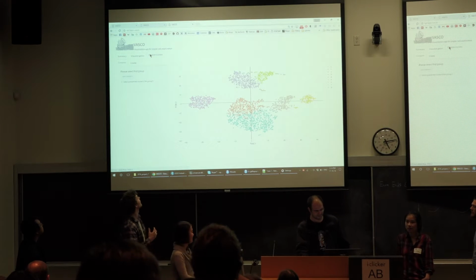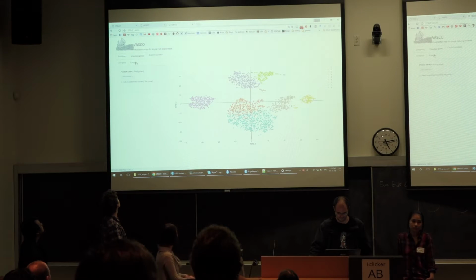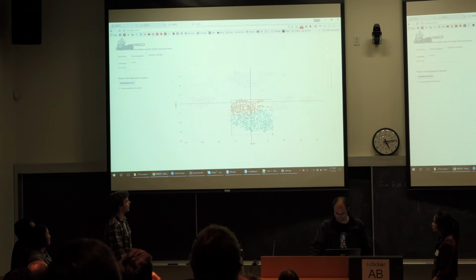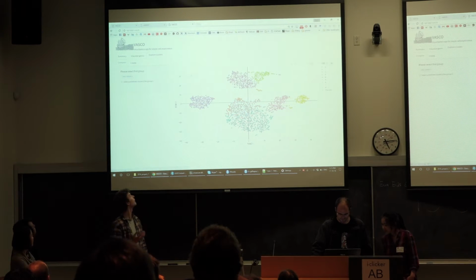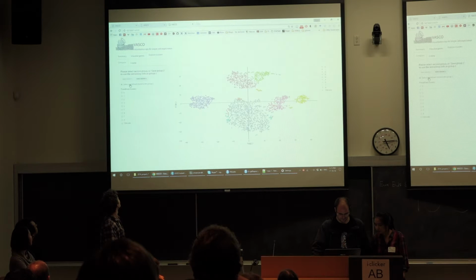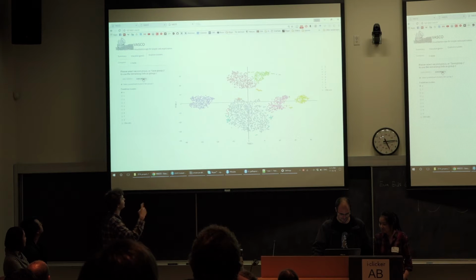So once users have identified potential clusters, we want to give them the ability to annotate them so that they can do further analysis. So we've implemented the ability to select a cluster and to annotate it. Say we identified CD4 cells in the last tab, we can annotate them as CD4 cells for future analysis. We also want to allow the user to compare between clusters so they can identify novel markers or other kinds of discriminatory analysis between clusters. So the user has the ability to select from predefined clusters, either from the clustering algorithm or from their own annotation, and compare gene expression between two clusters.